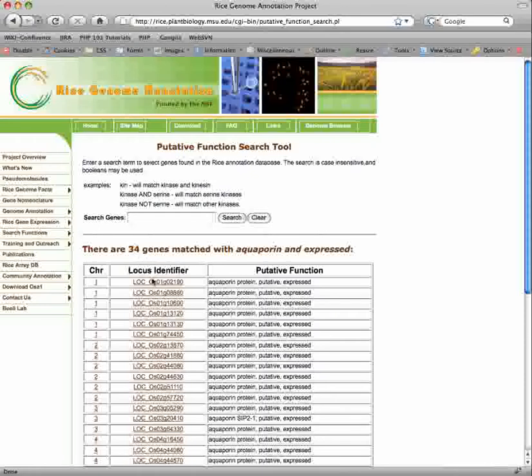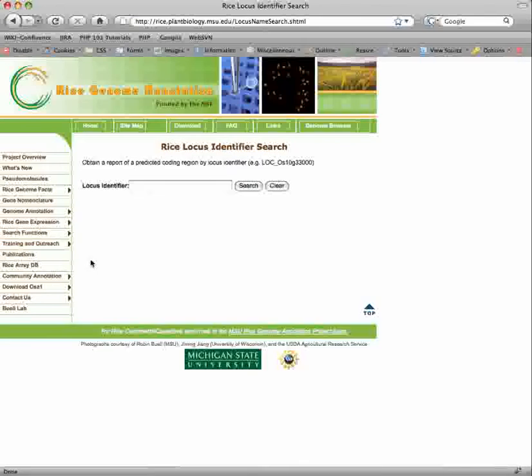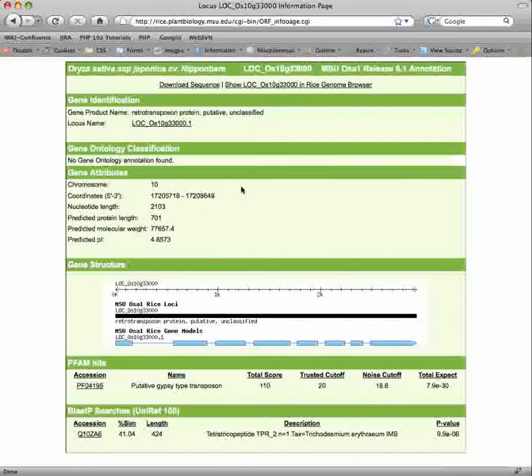Selecting the locus name will load the gene report page for that locus. The locus identifier search page allows you to insert your locus identifier in the search box and select search. The gene report page will load, and you can view the sequence and annotation of this locus.